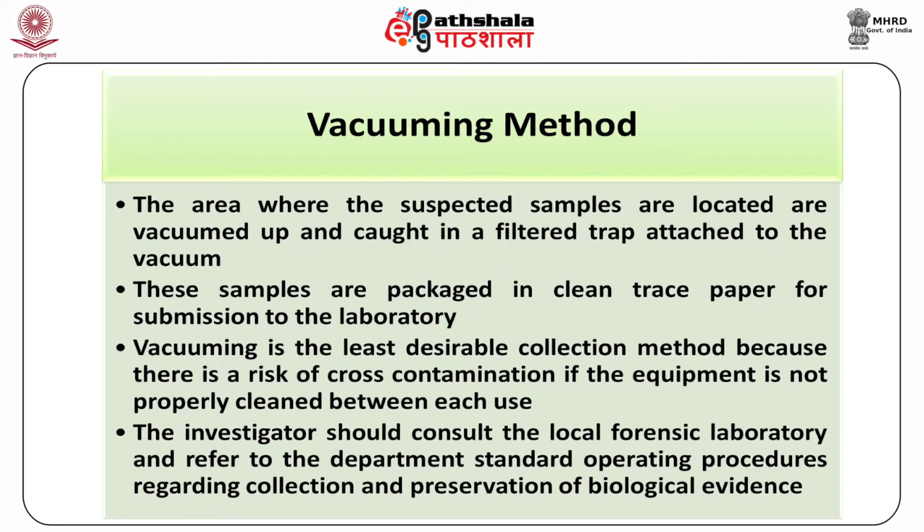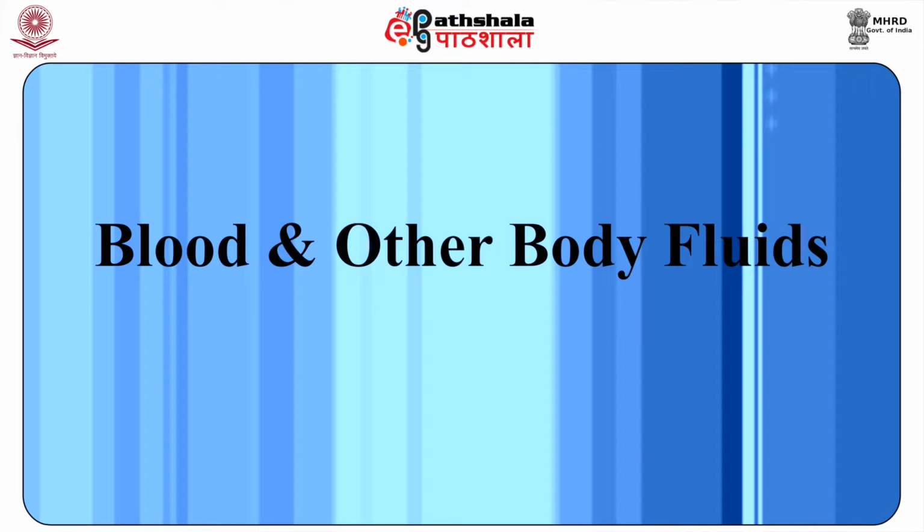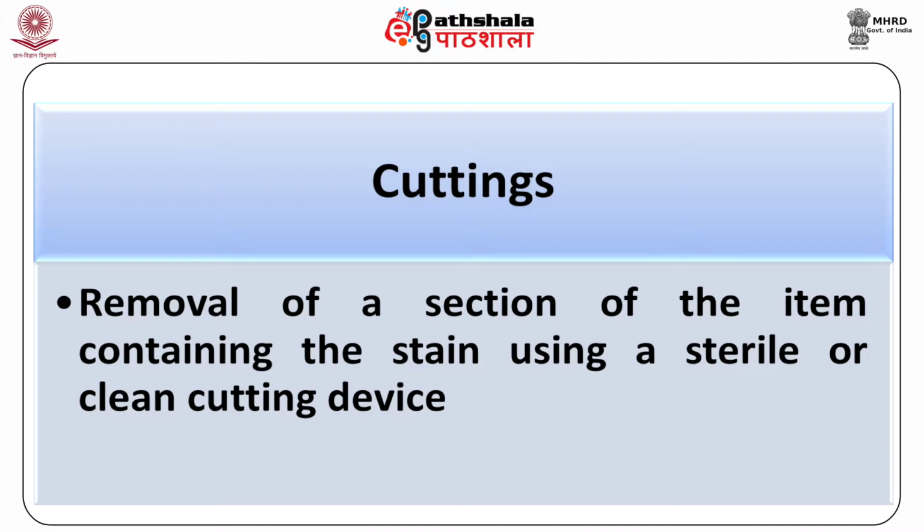Vacuuming is the least desirable collection method because there is a risk of cross contamination if the equipment is not properly cleaned between each use. The investigator should consult the local forensic laboratory and refer to the department standard operating procedures regarding collection and preservation of biological evidence.